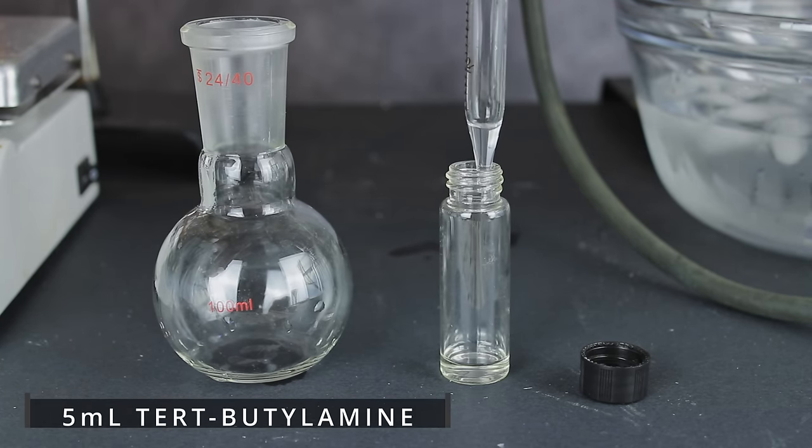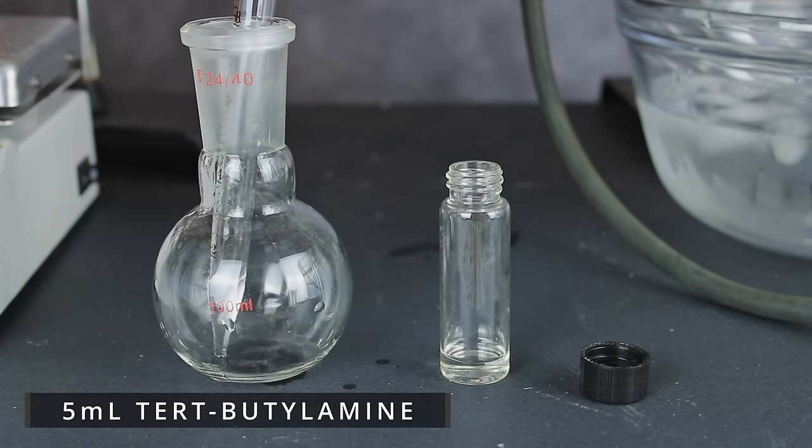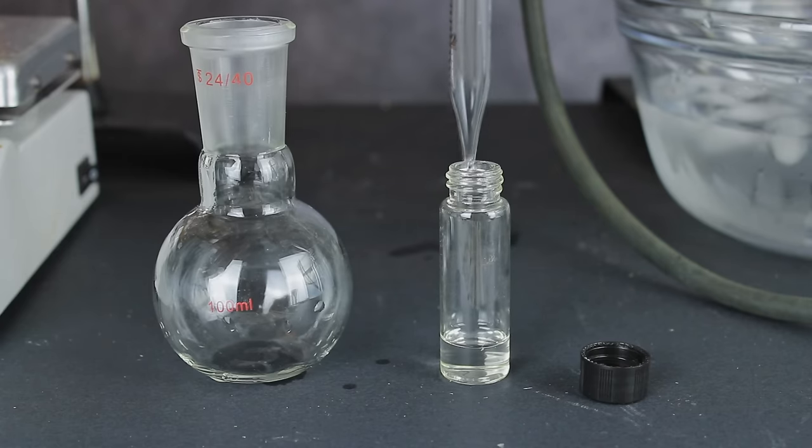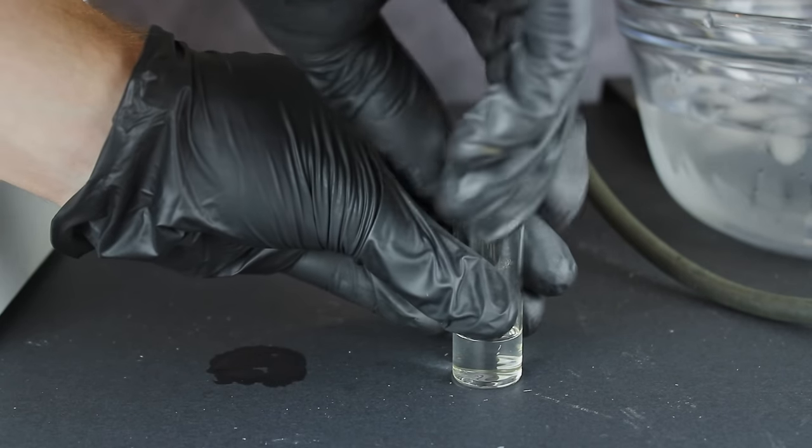In the end, I came out with just over 5 milliliters of crude tert-butylamine. The major contaminant here is water, which won't really affect anything, so I'm okay with it. If I had more product, I would try to re-distill it to get the 40 to 50 degree fraction by itself, but with such a small amount, I felt better just keeping it as is.